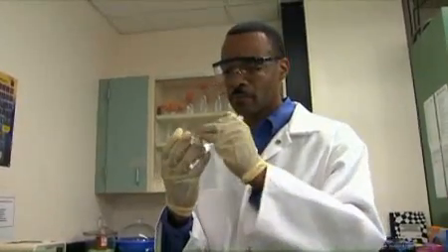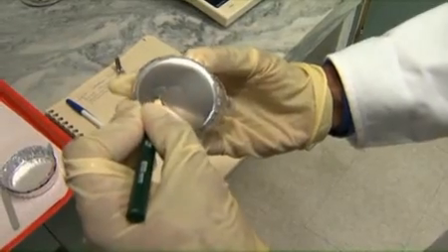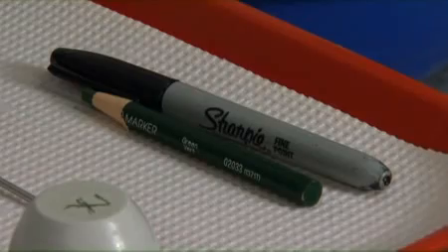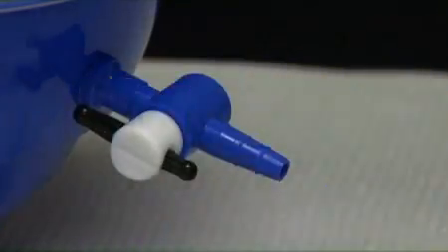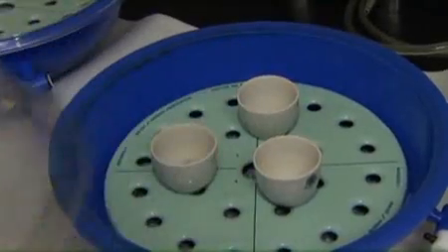If aluminum pans have been selected as the appropriate sample container, use a wax pencil or permanent marker to mark each pan with a unique ID number. Wax pencil is preferable because it is less likely to fade when heated. Before weighing samples, verify that they have reached room temperature; otherwise, the measured weight will be inaccurate, making the percent moisture value incorrect.